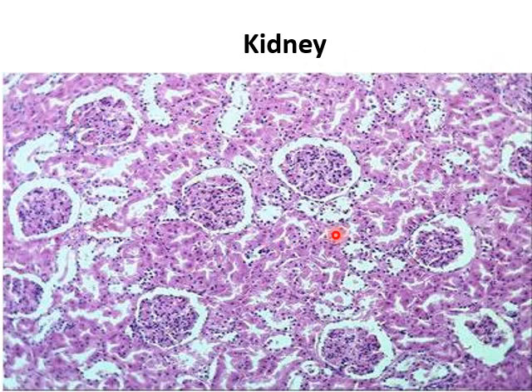Kidney. The slide is kidney shaped. The magnification under the microscope is a little bit less than that. Here we are in the cortex. As I can see, the Malpighian renal corpuscle, and these are the convoluted tubules.